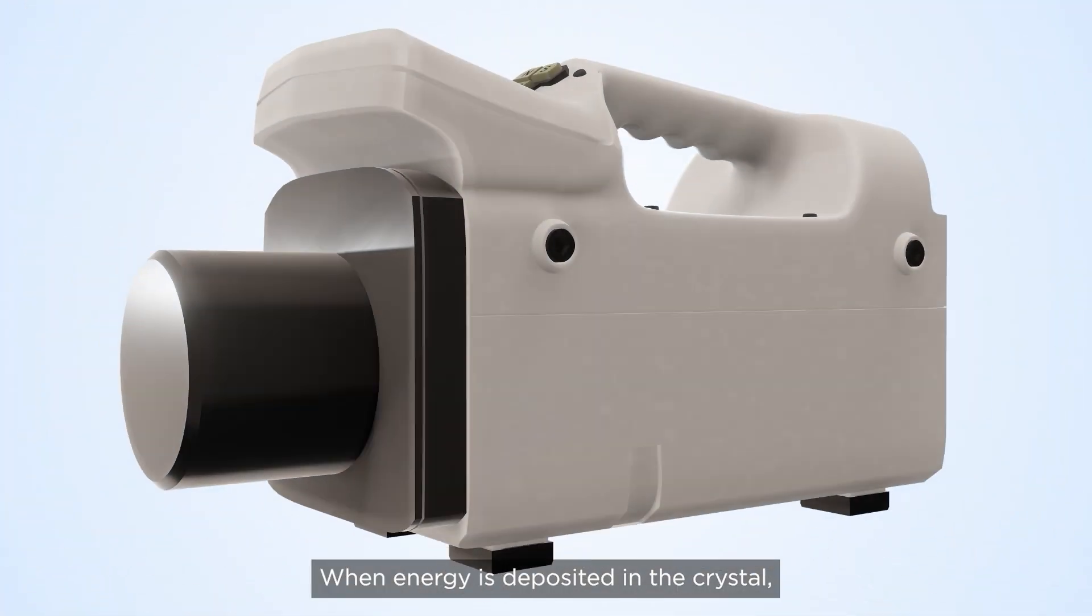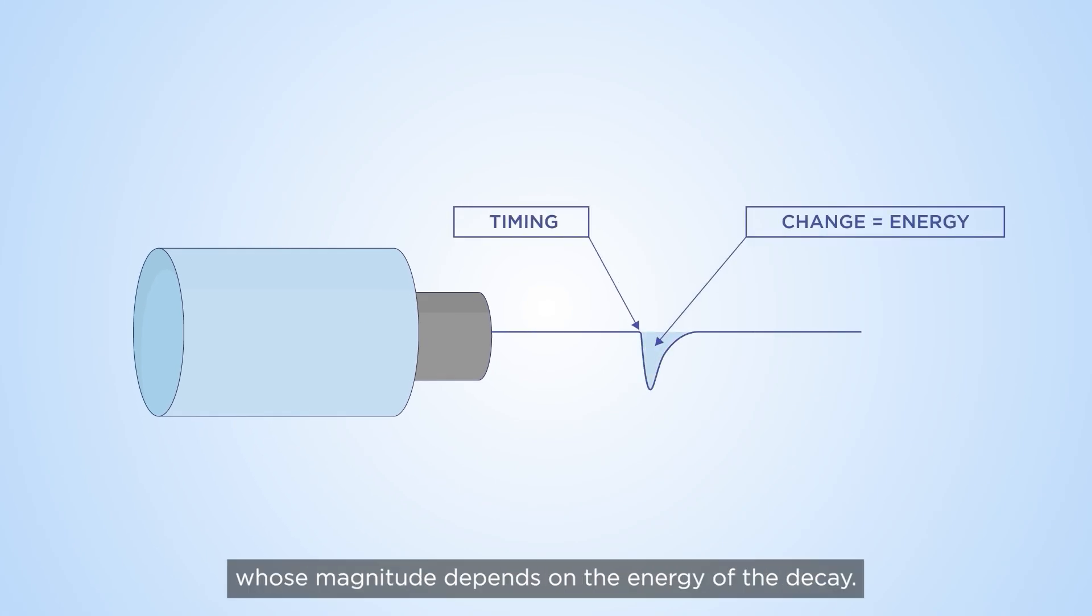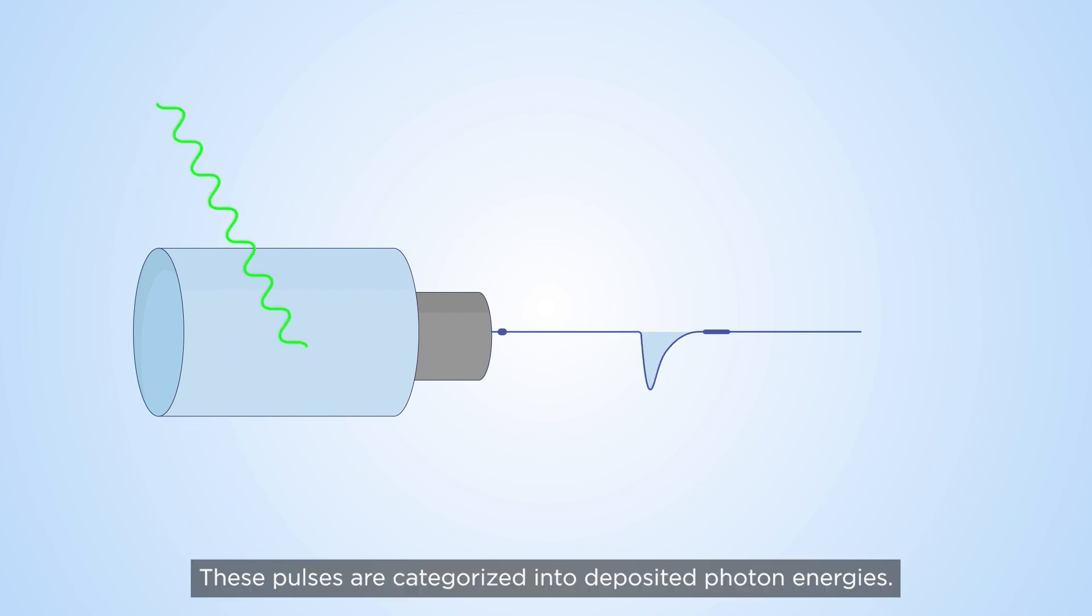When energy is deposited in the crystal, it is converted into an electrical pulse whose magnitude depends on the energy of the decay. These pulses are categorized into deposited photon energies.